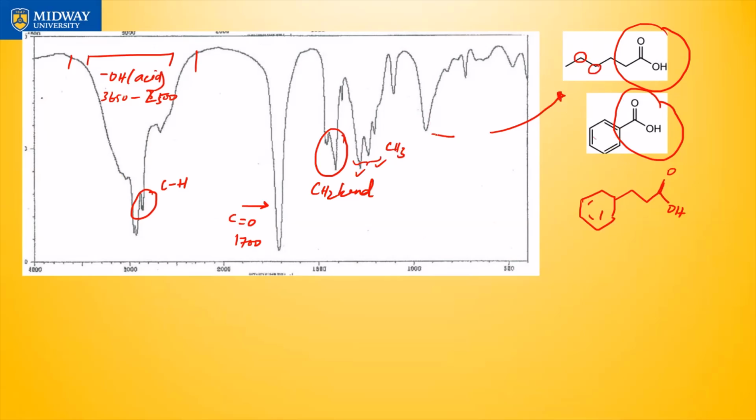This medium-looking size peak, medium to weak. You don't have those intermediate categories, just treat it as medium. Where is that at? It's almost 1,000, right? What would be at 1,000? There's not that many that are in the 1,000 range. I would say that it's probably the CO in some way, there's no COC, but I don't even know what this peak is coming from.